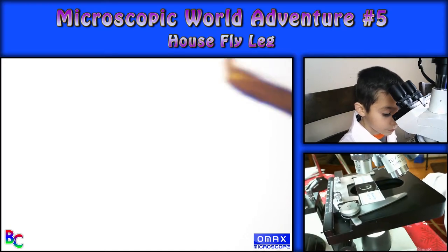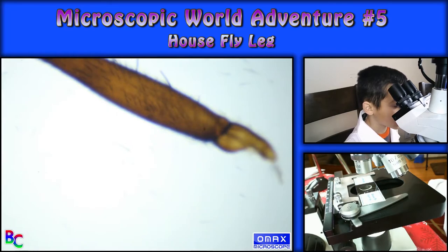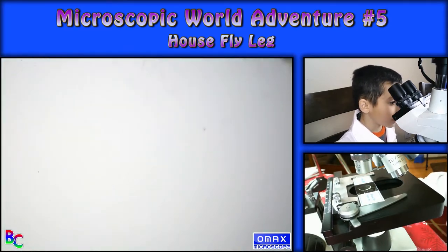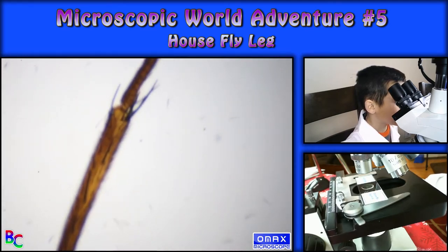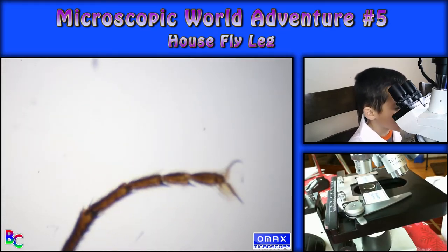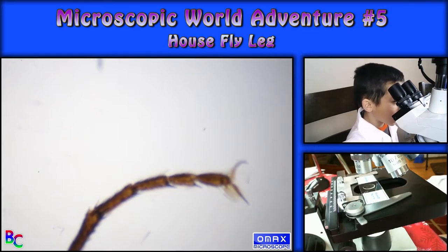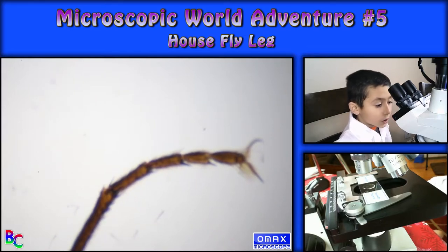I know where it is — right there, right on the turn. I feel like I've seen this before. Actually, that looks like a centipede, I think, because it's like long and has like a head.